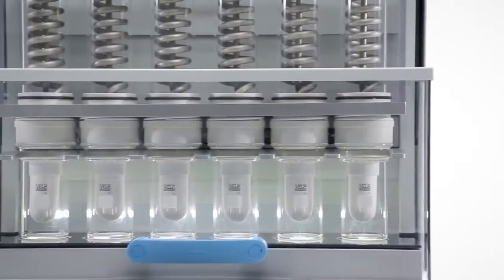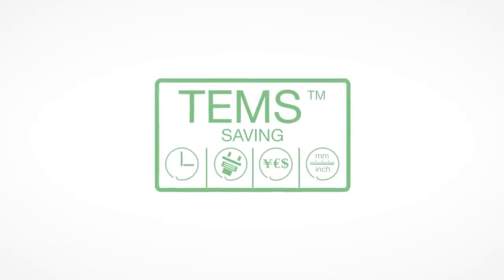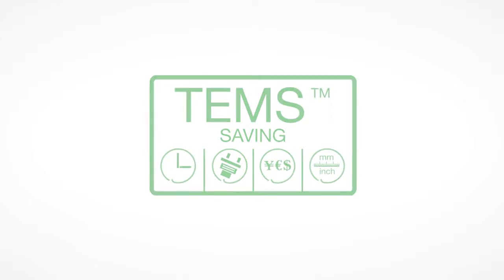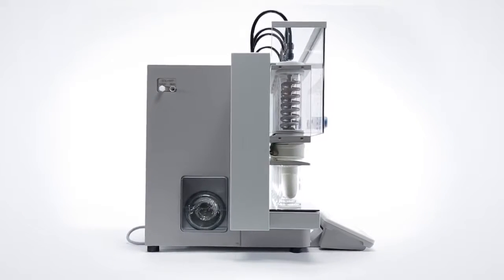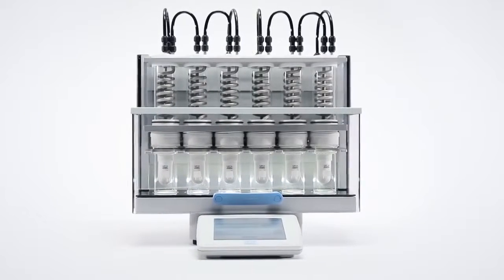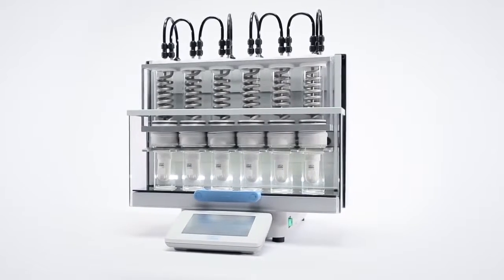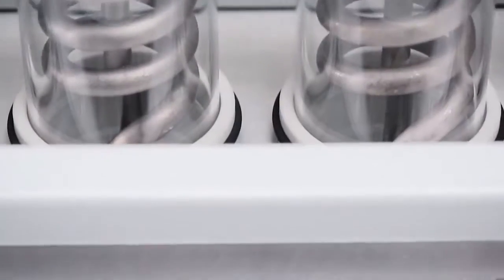The SER158 incorporates the exclusive TEMS technology to minimize your overall operating costs. Compact design, low energy consumption and high solvent recovery makes the VELP SER158 the perfect solution for a large variety of solvent extraction applications.